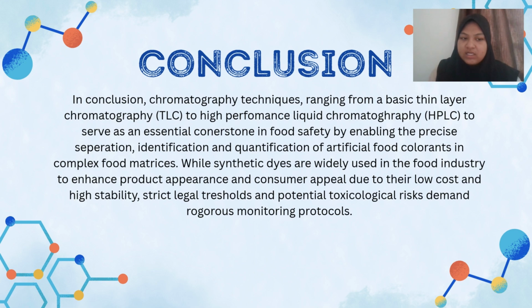While synthetic dyes are widely used in the food industry to enhance product appearance and consumer appeal due to their low cost and high stability, strict legal thresholds and potential toxicological risk demand rigorous monitoring protocols.